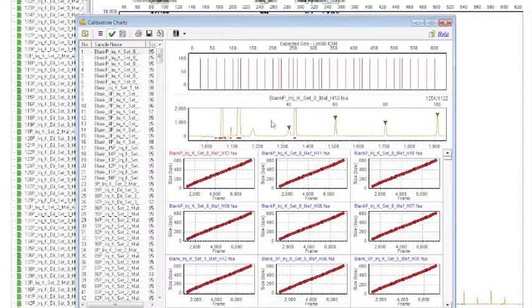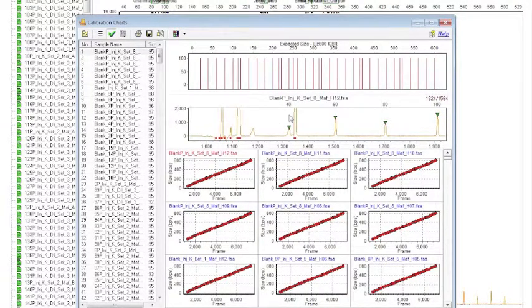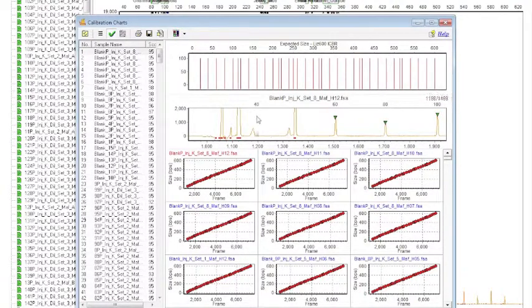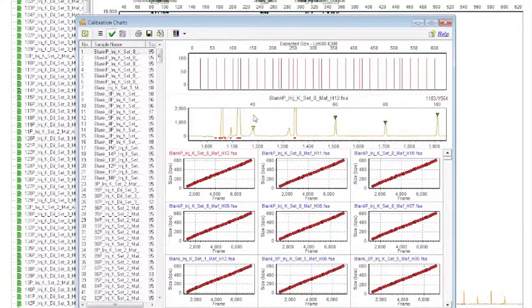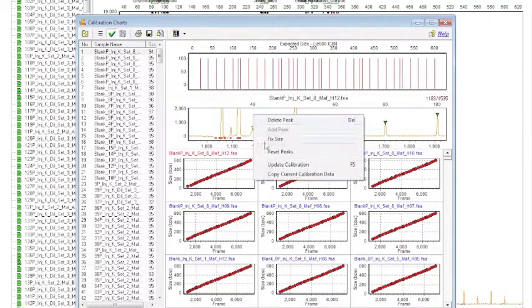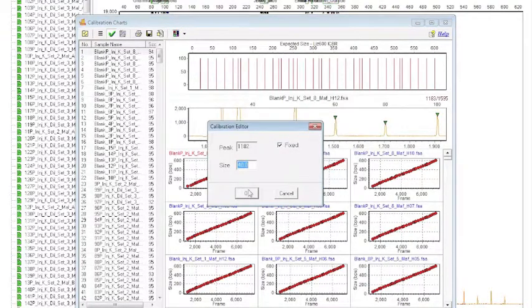In previous examples, I have shown you a trick where you hold control and then left click and drag the 40 over, and then right clicking, fixing size, and changing it to 20.